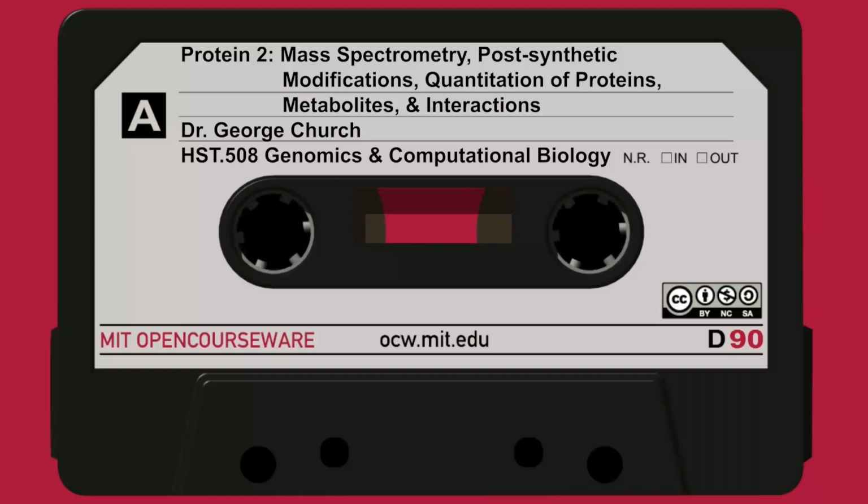And this one we won't belabor, but here you can see how it conceptually maps to the simplest one that we talked about at the beginning, which was comparing two amino acid sequences. There, the indels were caused by evolutionary change. Here, the insertions and deletions are due to a missing ion, due to inefficient cleavage in the gas phase. This is further complicated by this necessity of essentially sequencing in both from the B and the Y simultaneously and making sure that you have the best combination of B and Y assignments. Okay, so that's de novo sequencing.